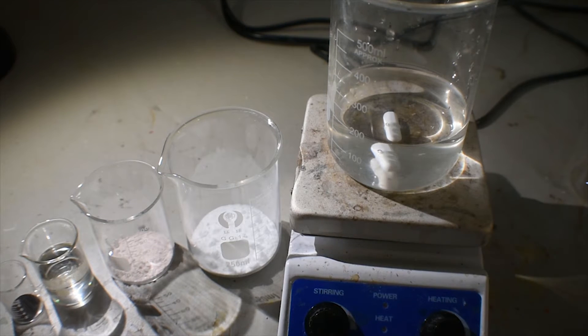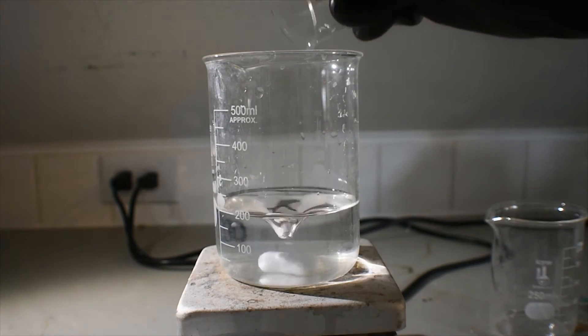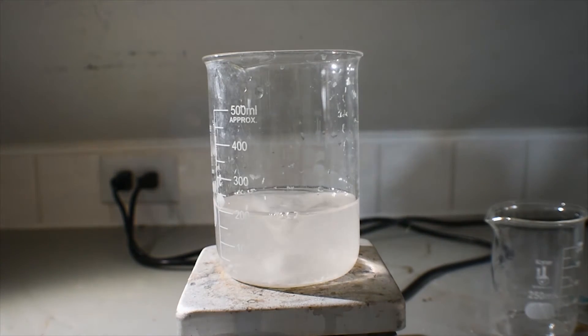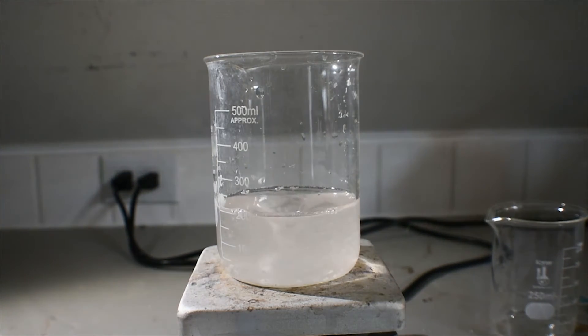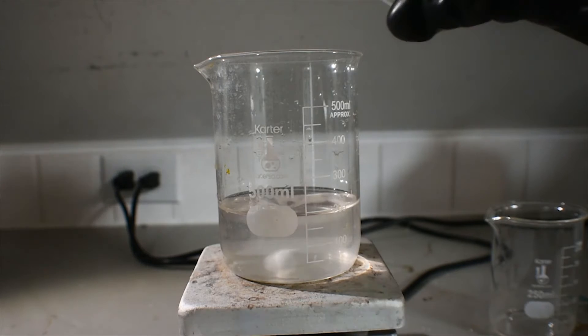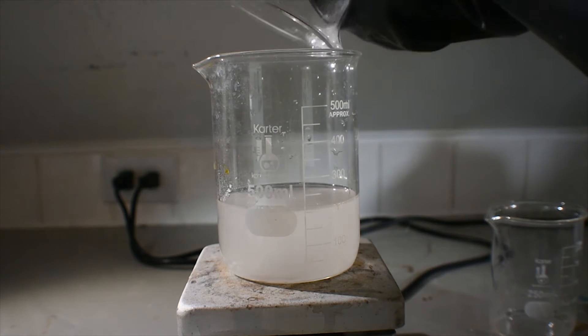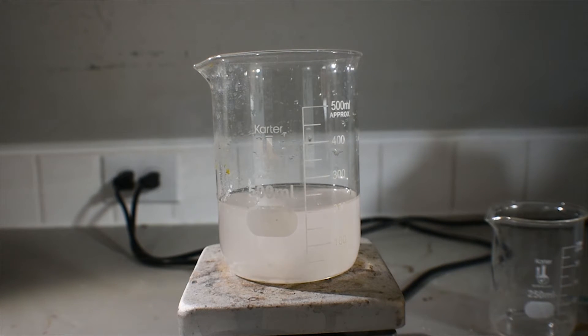With 200 mL of distilled water weighed out in a 500 mL beaker, I'm going to dissolve both the manganese chloride and the sodium acetate in the distilled water. Since there seem to be a few impurities in my manganese chloride — as it was homemade — I'm going to go ahead and filter this solution. Now that everything is filtered, I'm going to go ahead and add the sodium acetate. Once this is all dissolved, we can continue.